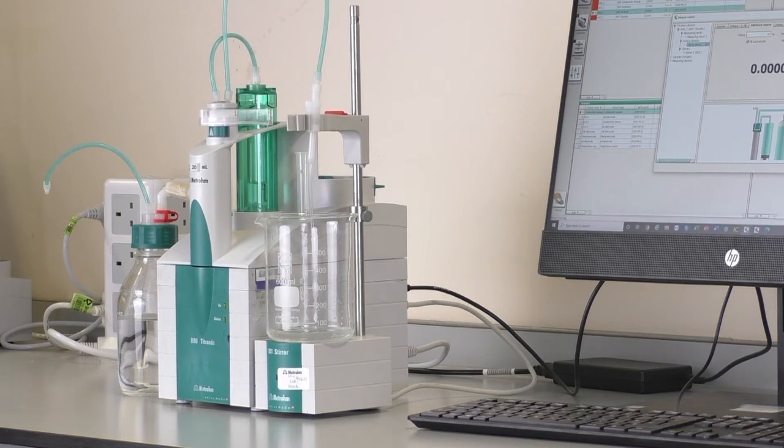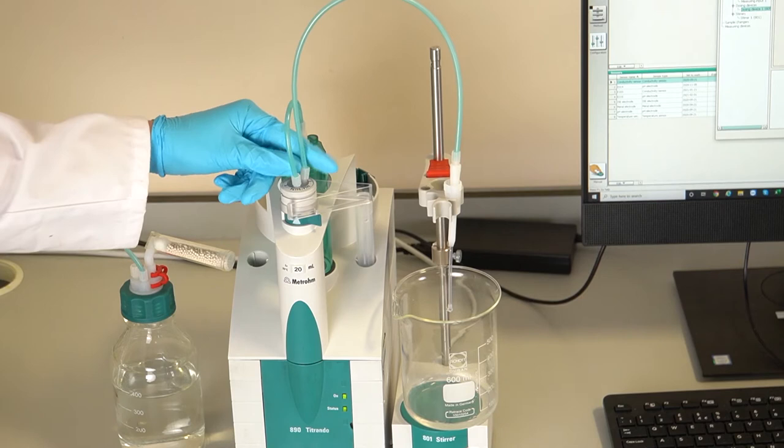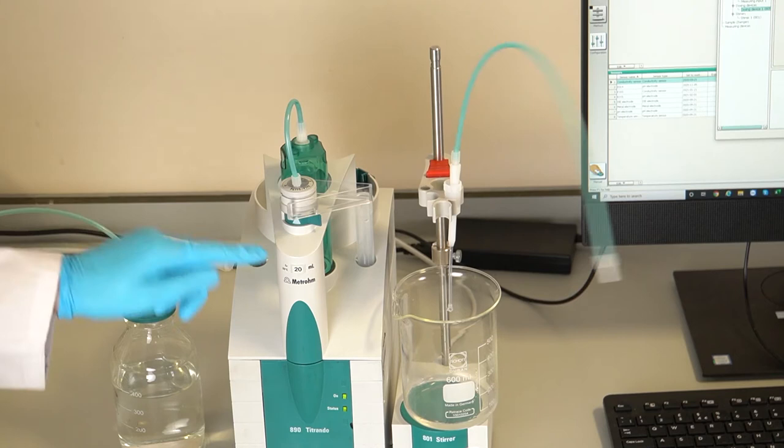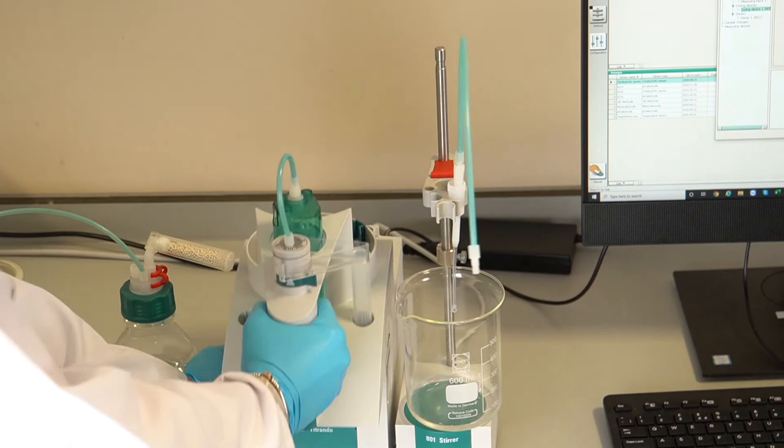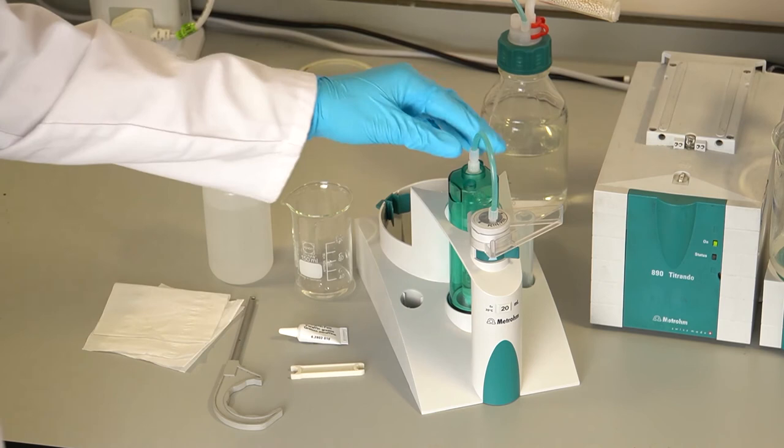Remove the remaining tubing. Check that the switching lever is over to the right. Remove the exchange unit from the drive. Unscrew and remove the cylinder unit.